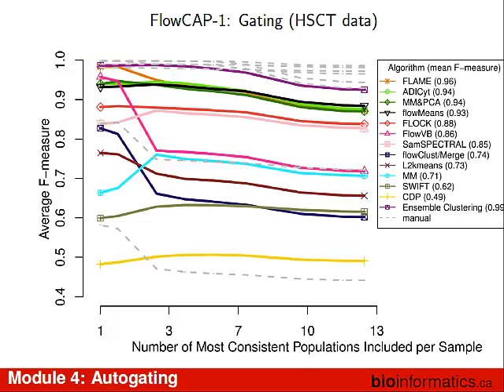And so we call that population one. Most people put the same box, though this one's a bit of an outlier, and they're all experts in the field. We can say this person's an idiot. Maybe they're not. Maybe this is the only person who knows how to get it right. How do you evaluate that? But there are 1, 2, 3, 4, 5, 6, 7, 8 humans, and most of these eight humans all agreed on this one population because they were all putting in all the same dots.